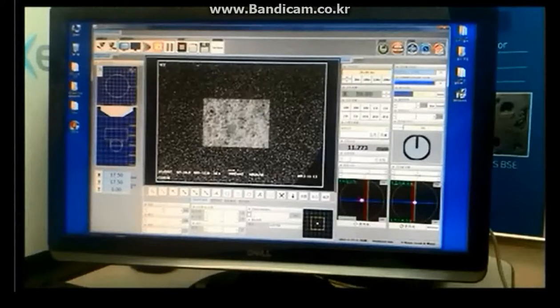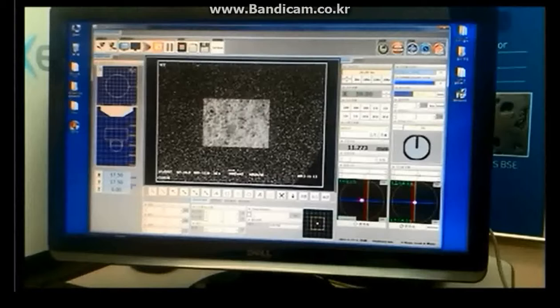After aligning the gun hardware is over, we need to align the gun align UI. We will now begin the gun align UI.